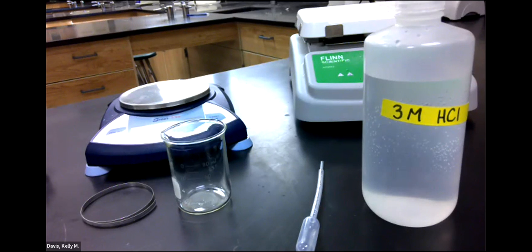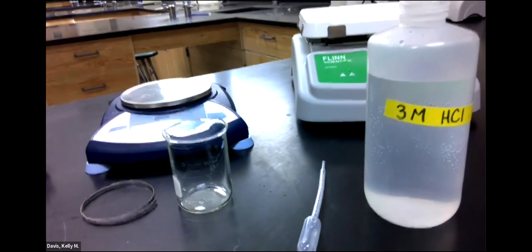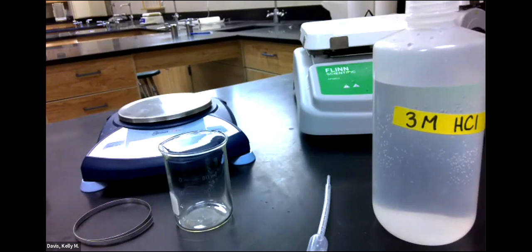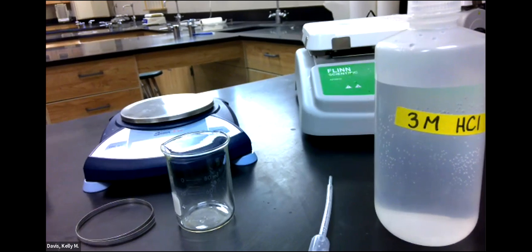So in this video, I'm going to do a demonstration of the empirical formula lab with magnesium and hydrochloric acid, so that you can see the lab and take notes, record data, and do the calculations. First, I'll start by talking about the lab handout.